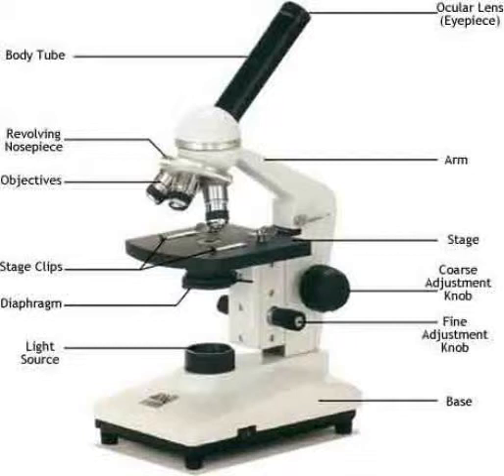Number 6, make a wet mount of an organism in pond water. You may need to add some Protoslo to the drop before adding the cover slip to slow the organisms down. Number 7, see diagram. Number 8, draw a diagram of the organism under an appropriate power. Estimate the size of the organism and include it on your drawing.